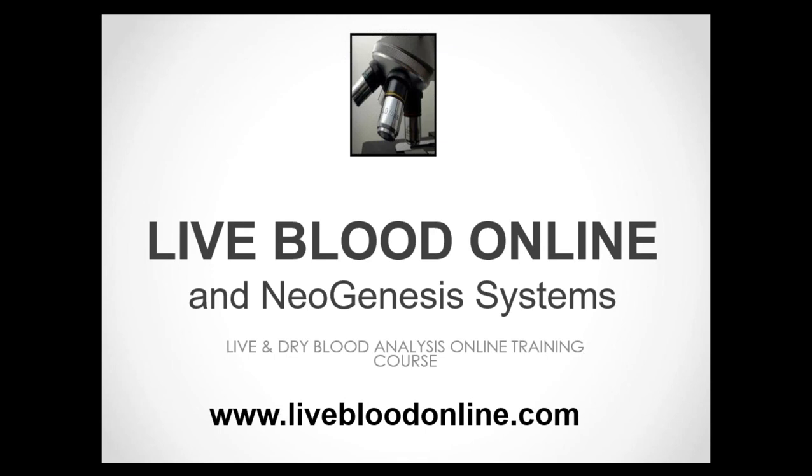So just to confirm the 5 main points about the benefits of live blood analysis, Dr. Ocker, was number 1, it helps you confirm and better detect imbalances and health issues. Number 2, helps you decide the best course of treatment.